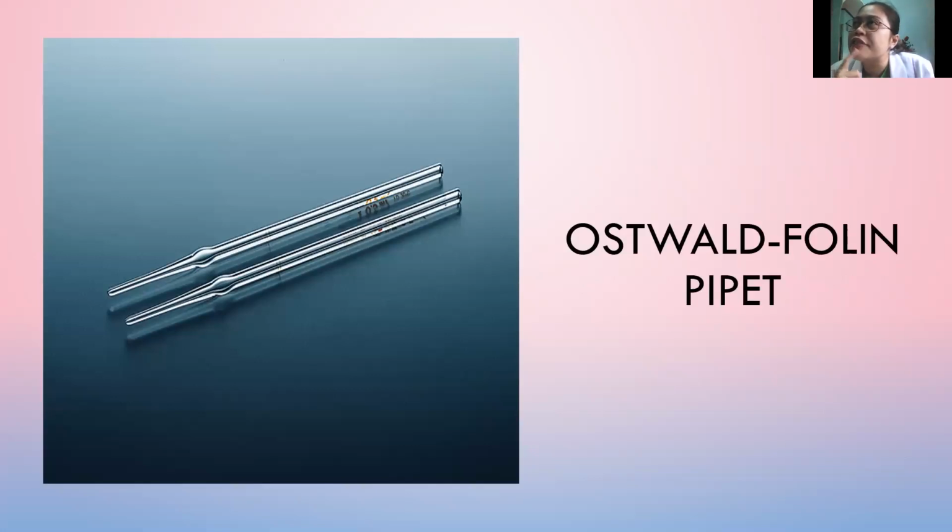Paano siya nag-differ sa itong isa, volumetric pipette? Take note that the volumetric pipette, ang valve niya na diri medyo sa taas. Kani diri siya more likely sa end, but it also has one calibration. So if this one is for 10 ml, then hangtod 10 ml lang jud ang iyahang gina-measure. Now, para asa si Ostwald-Folin pipette class.